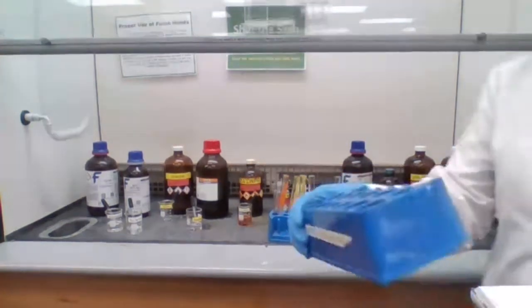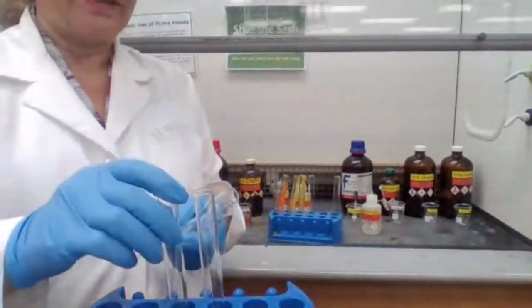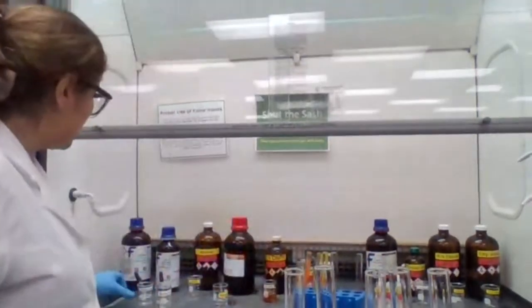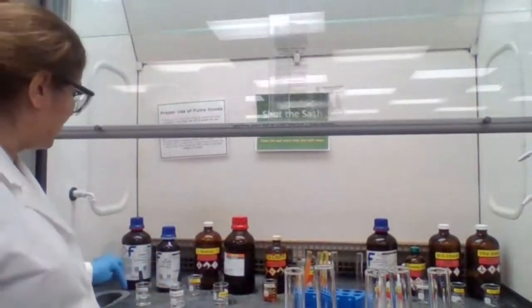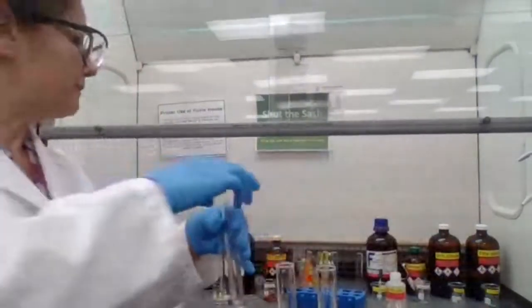Okay, you record the evidence for Tollens reagent. What is the next test? Iodoform test. Should I test for aldehyde or should I test for ketones only? Iodoform test goes for ketone only. We want to know if it's a methyl ketone or it's not a methyl ketone. So I'm going to test two compounds only, two of the ketones. One is the acetophenone and the other one is the cyclohexanone, and look for the difference.